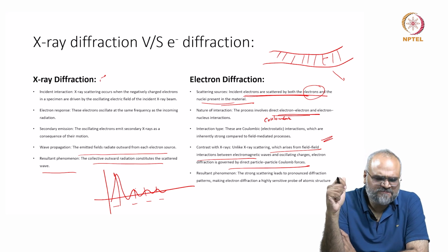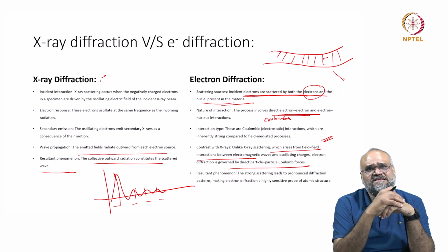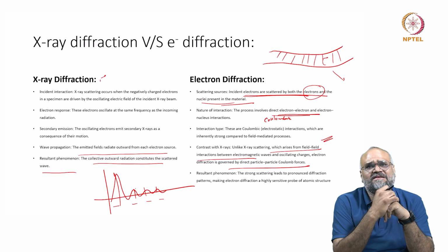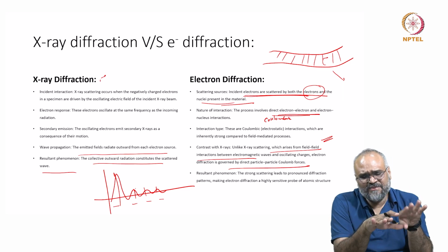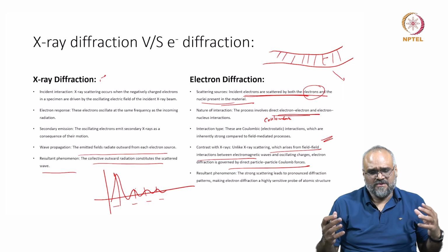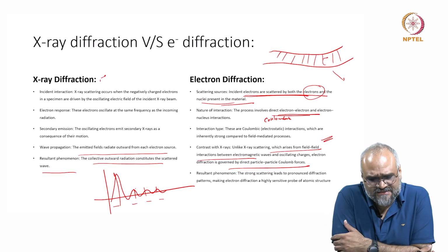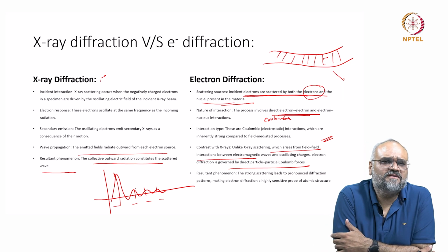Quite often within a small region of a specimen, from one portion you may see a very symmetric diffraction pattern, whereas just adjacent to it you might see a significantly misoriented diffraction pattern. So, what is the objective of doing all this electron and X-ray diffraction? You would want to solve an unknown crystal structure within a material.